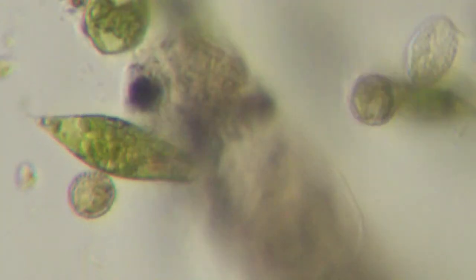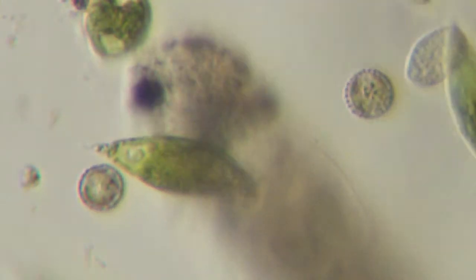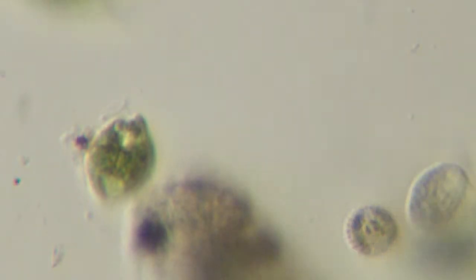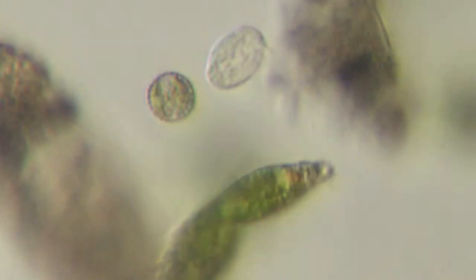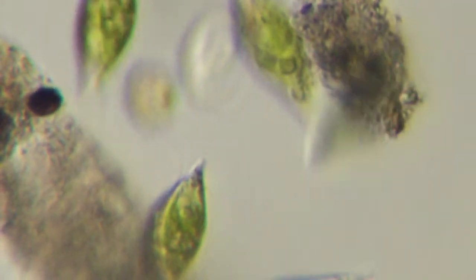Yeah, a couple are a little spiky, or not spiky, but little guys with the dots on the cell membrane there. Interesting. There's that Euglena slowly whipping its flagellum there. See that little hair-like thing whipping around, curling up. Shot of the eye spot and the flagellum there whipping around. I have to constantly focus up and down. The Z is just way too thick at this magnification. Another reason why I didn't go to oil. This oil is just 1,000 power, and it's really, really, really shallow depth of field.